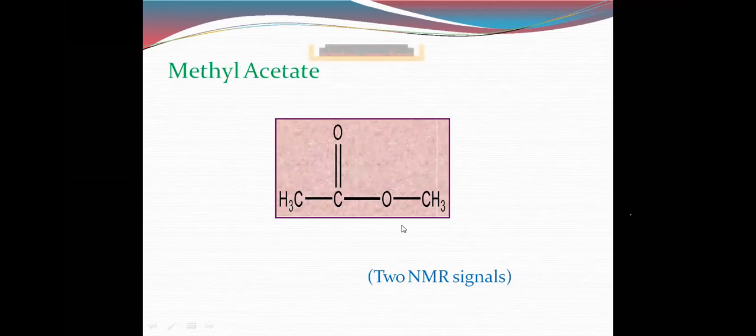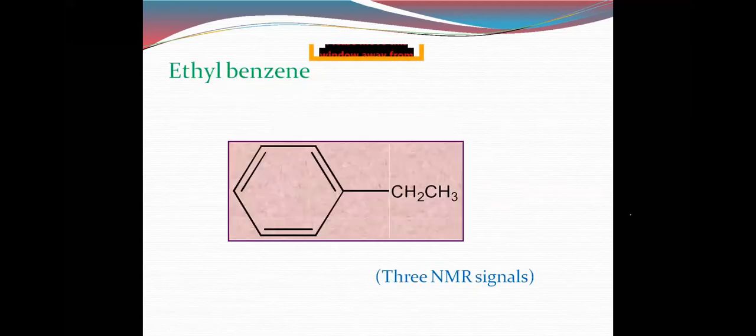So two NMR signals, two NMR peaks will be there. Getting the point? Yes, sir. Very good. Thank you.